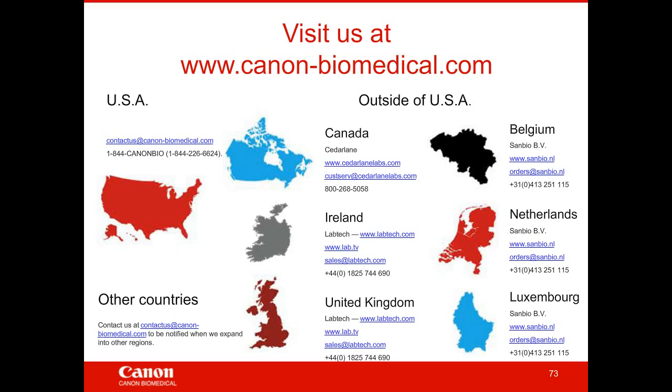So we do have some questions coming in already, Dana. Our first question is: is this offered as a service? So that's a great question that we often receive. These assays are not offered as a service through Canon BioMedical. They're sold as reagents to run in your own lab.